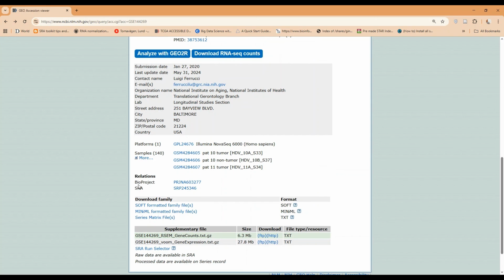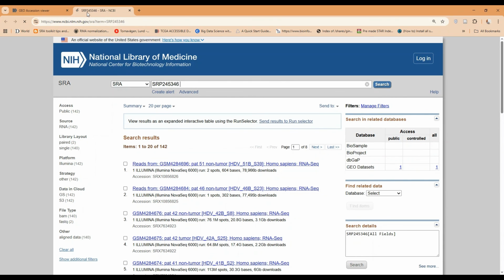But if you look at this one, that SRA, that I told you about in the previous lecture as well. I was about to take you to this SRA website next. This is also part of NCBI, and you can just go there, and if I open it here, you can see, yeah, this will take me to this data set.